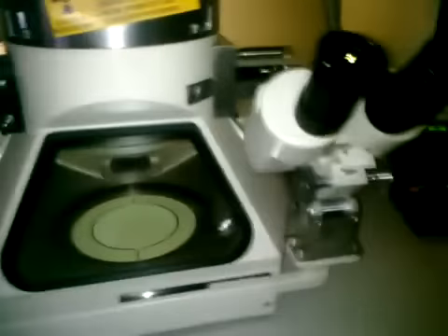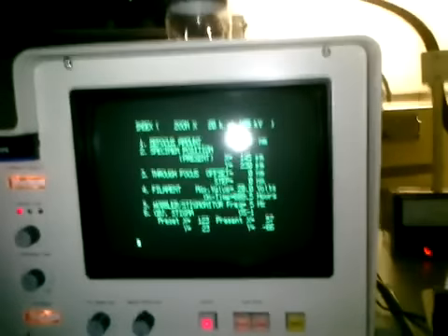Once we're done with that, we take a morphological picture, and we move on. What we're looking at here is this particular scope is a scanning transmission electron microscope, or a STEM. And we can do things like coordinate location. This is what the scanning portion looks like. I don't know how well that's going to look. Let's focus it in a little bit. There is our asbestos structure.